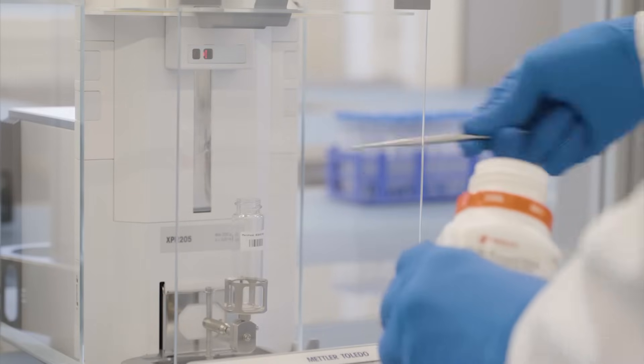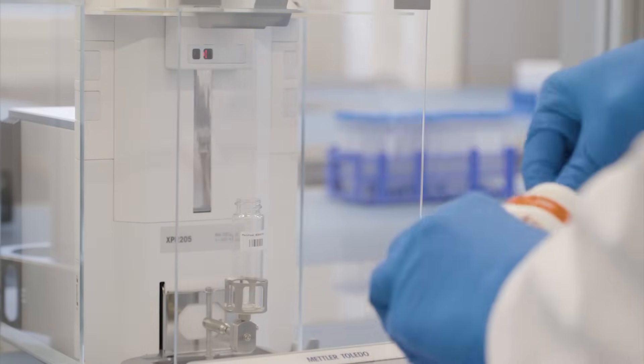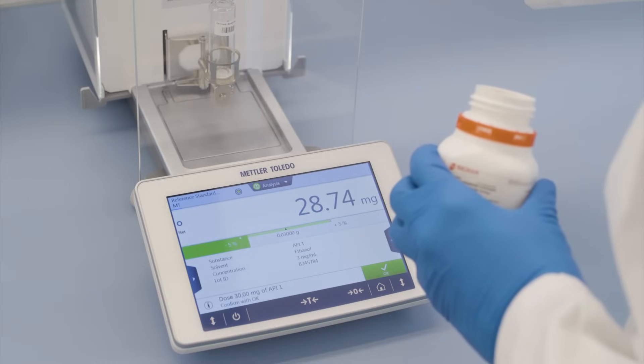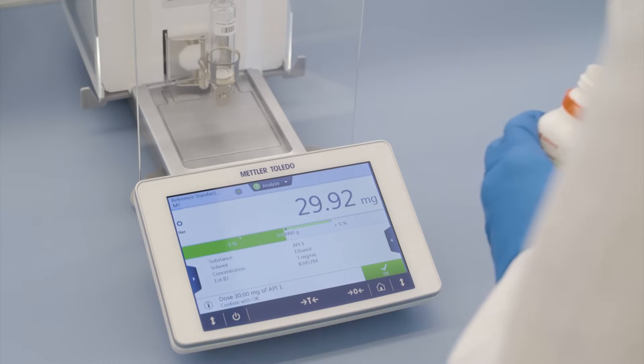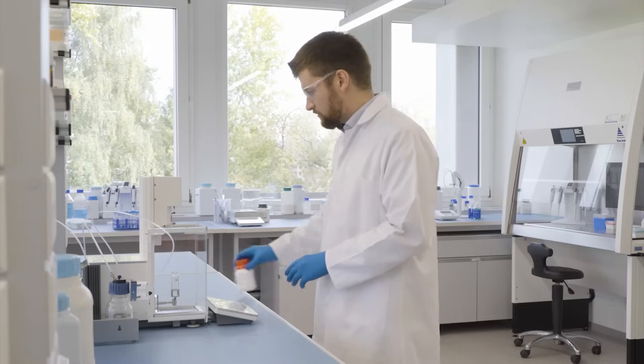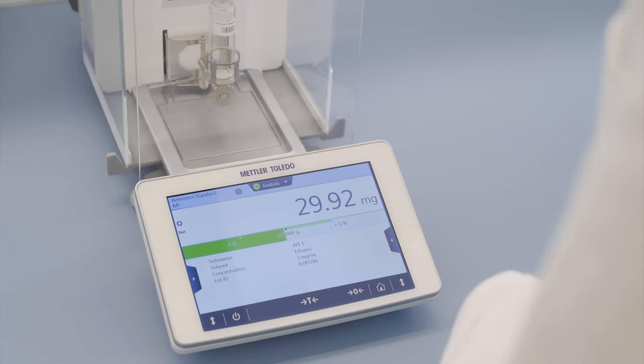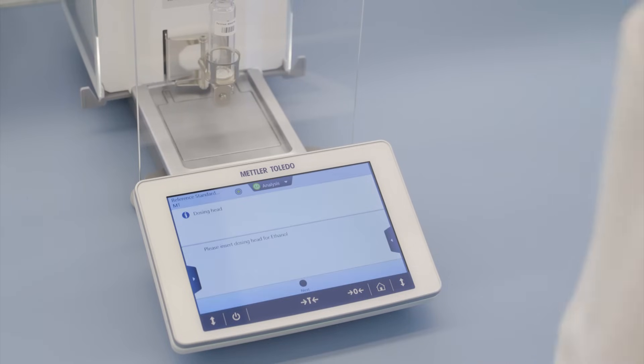Weigh the approximate amount of reference standard within the predefined range directly into the large vial. LabX uses the actual weight recorded by the balance and the purity of the reference standard to calculate the precise amount of solvent required to reach the target concentration.